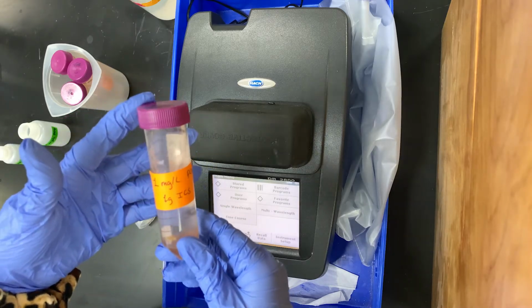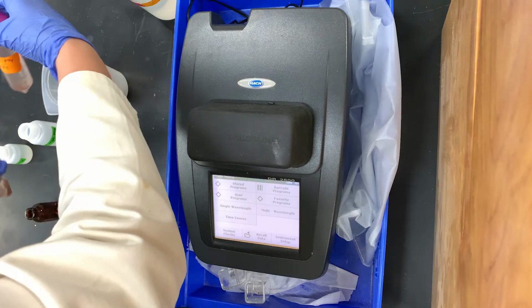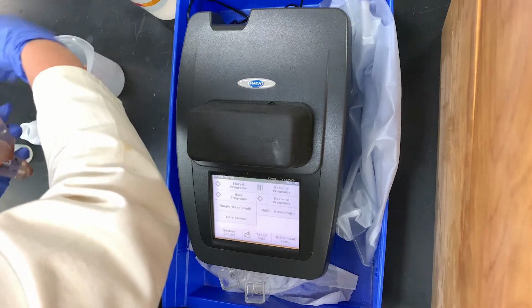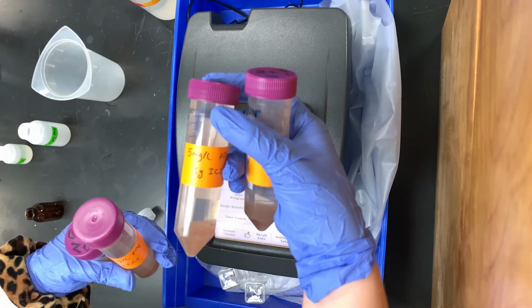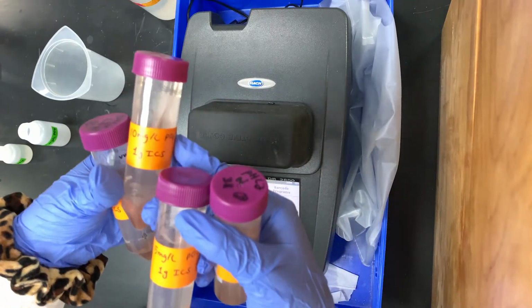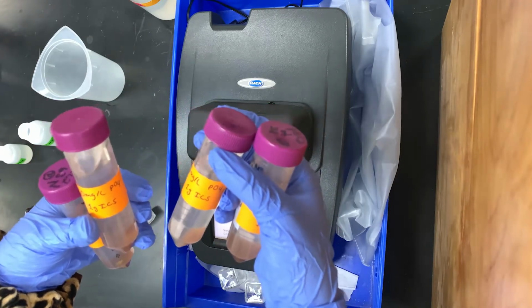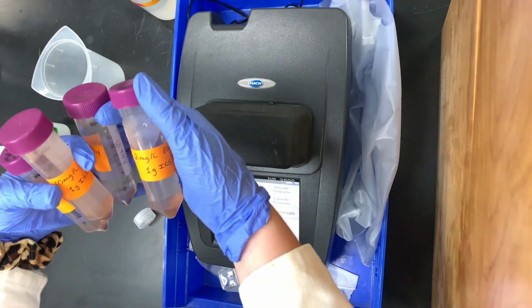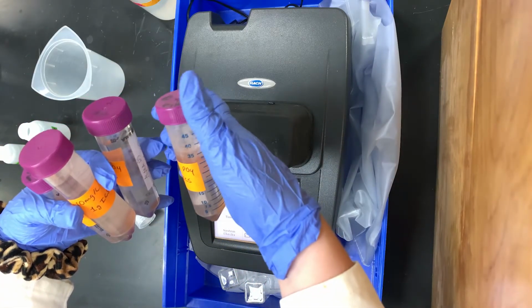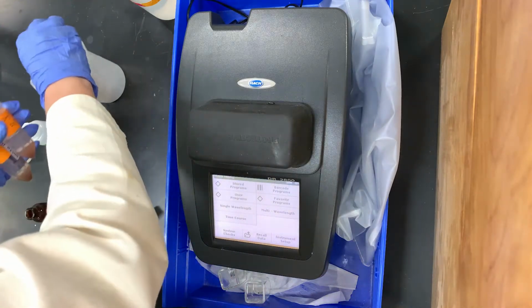It is now the next day, and I realize I forgot to show you guys the rest of the centrifuge tubes that the other 3 standards were made in. This is our 1 milligram per liter solution with our 1 gram of iron-coated sand. We also have a 2 milligram per liter, a 5 milligram per liter, and a 10 milligram per liter phosphate solution, all with 1 gram of that iron-coated sand. These have taken on a little bit of a reddish-orange hue after being in the rotator for 24 hours.